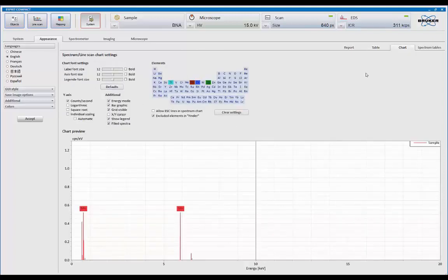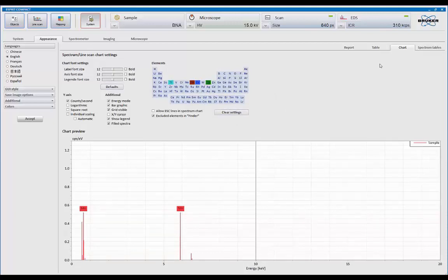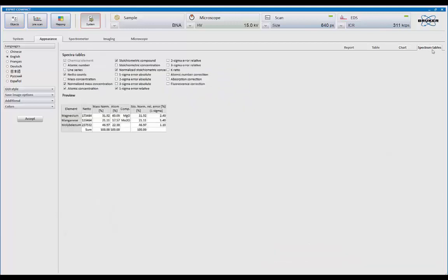Chart is for the X-ray spectral display. Again, this is what defaults you want for KLMR markers. How detailed you want it, whether you want a background color or not.